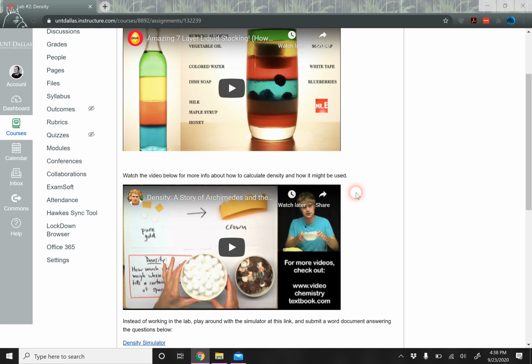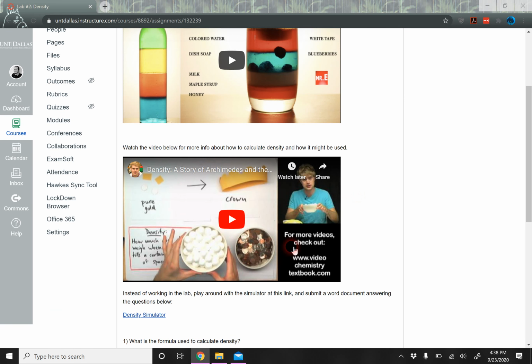Second thing you need to do is to watch this second video, and this talks about a use of density and how it can be helpful in determining the identity of a substance. It also explains how to calculate it, some things like that.